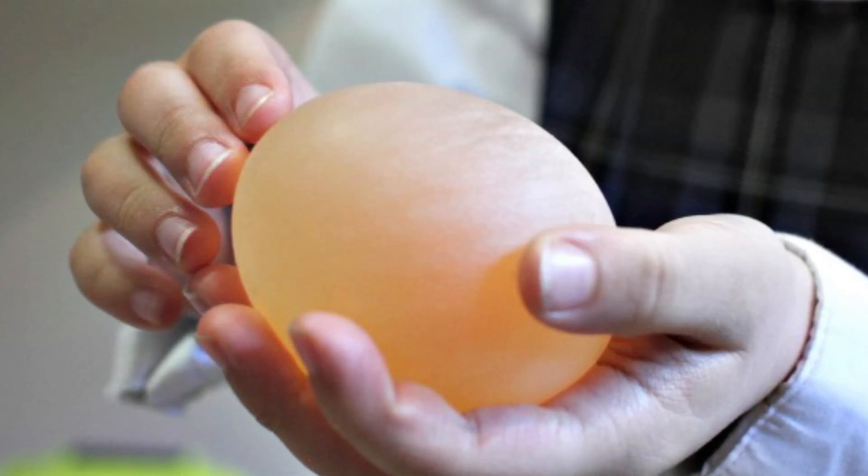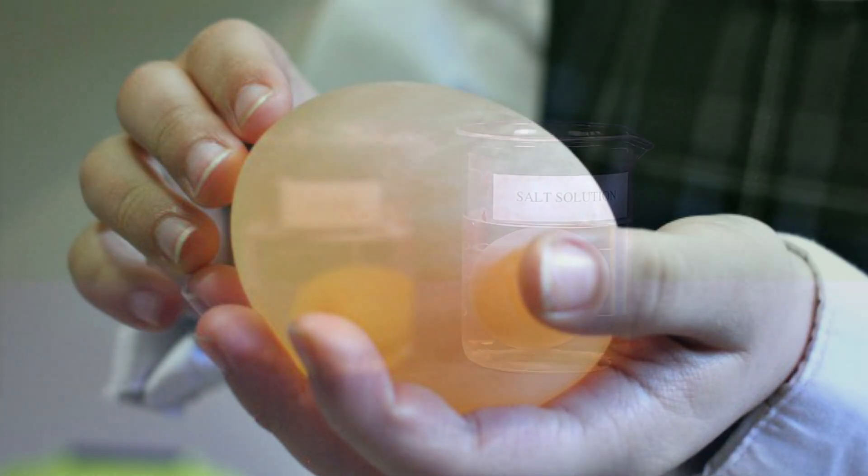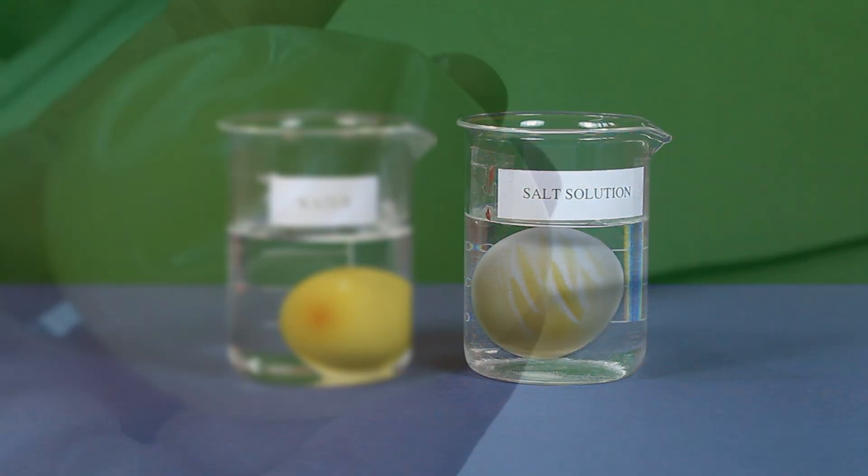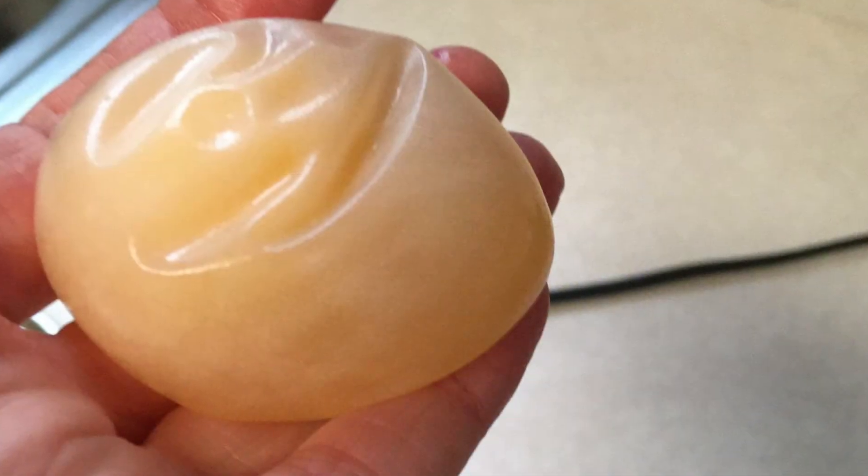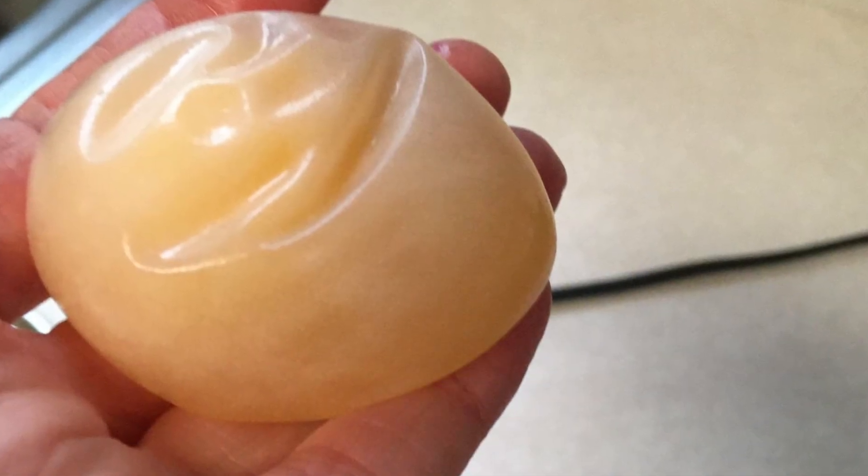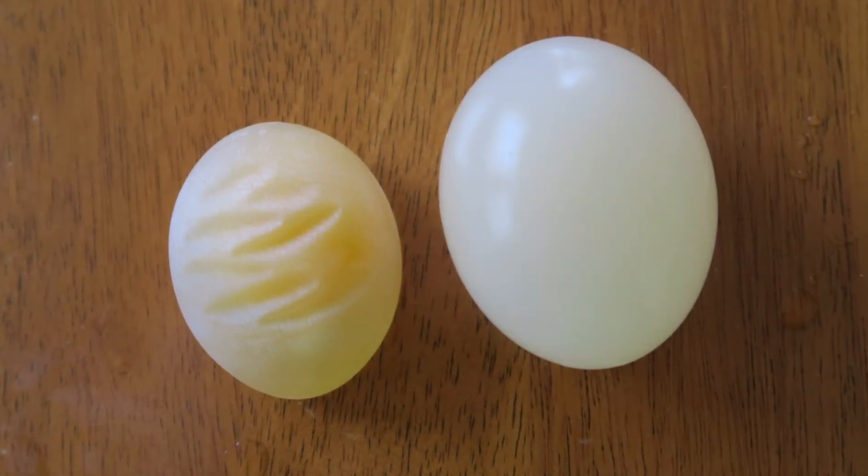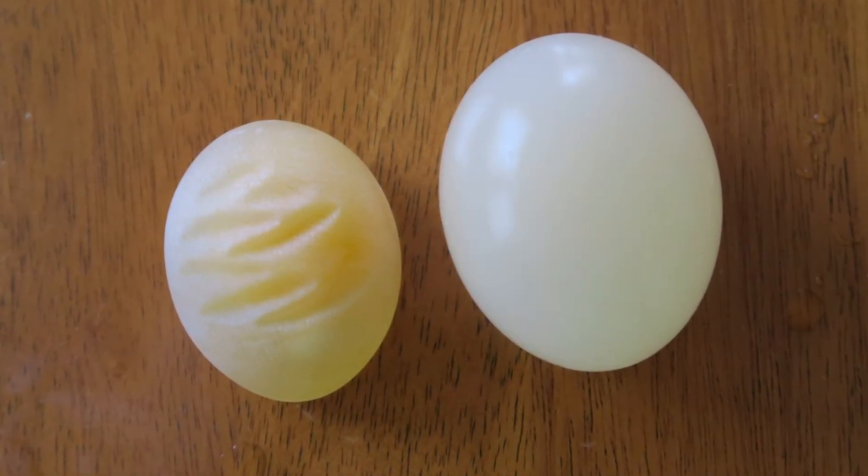The de-shelled egg when placed in a salt solution loses water and results in the shrinkage of the egg due to exosmosis. That is, the water comes out from the de-shelled egg into the salt solution.